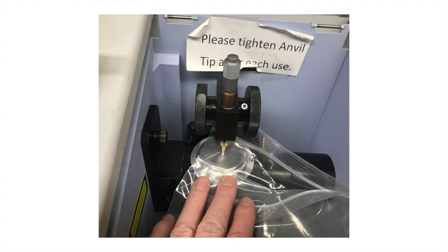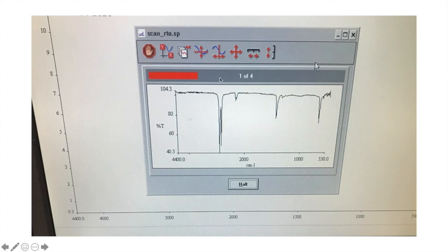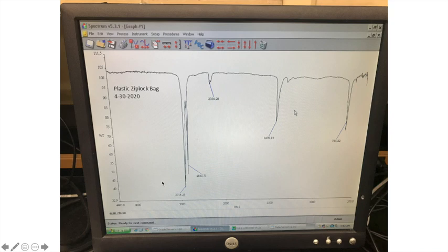Here we go. We ran our background. Looks good. And now we're going to put the plastic bag on the ATR adapter, and we're going to turn the wheel to crush it down on the zinc selenide crystal. And I turned it tight so I just barely see any of the silver above this copper. And there it is. And I start scanning it. One of four scans is showing up. And then boom, it's done. And I label some signals.